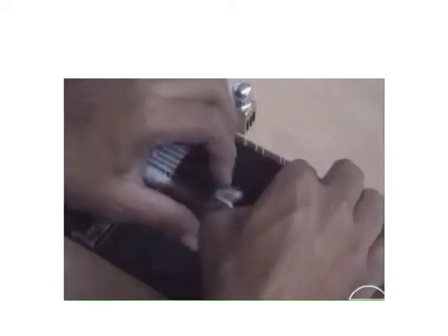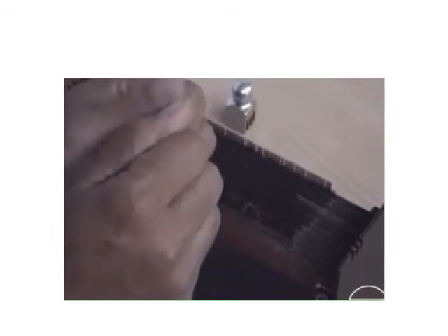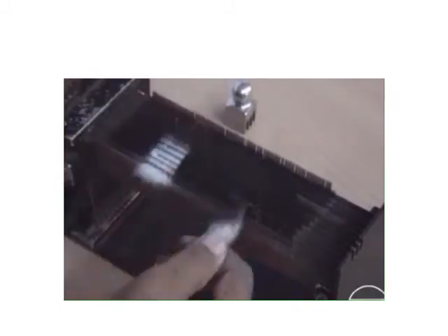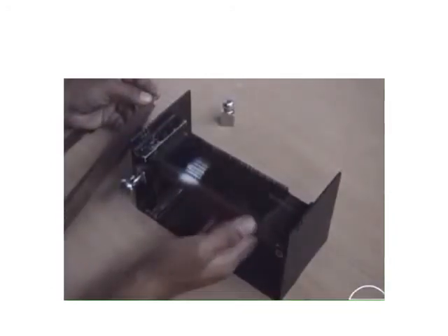Using the depressor, press the fibers. Using needles, take out the remaining fibers and also prepare that sample. Do not waste any part of the representative sample because it represents a great lot of fibers. So place it again, press using the depressor, pull using the combs and comb it and place it on the left hand side. Transfer all the fibers from right hand side to left hand side.